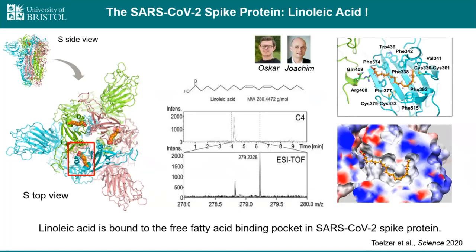So based on this, we hypothesized that the pocket is conserved, and we also solved the structure of SARS-CoV-1 and showed that it is conserved since at least 20 years. And the good news is that it's also conserved in Omicron and all the other variants of concern. So actually, Kapil in our group purified all these RBDs, and I'm not going to show you all these Biacore curves, but just the three most interesting facts we found.